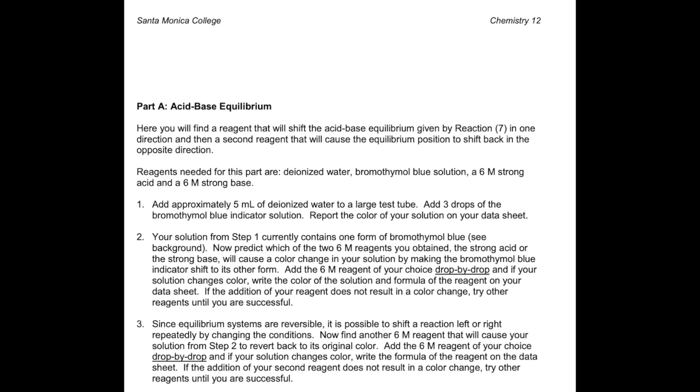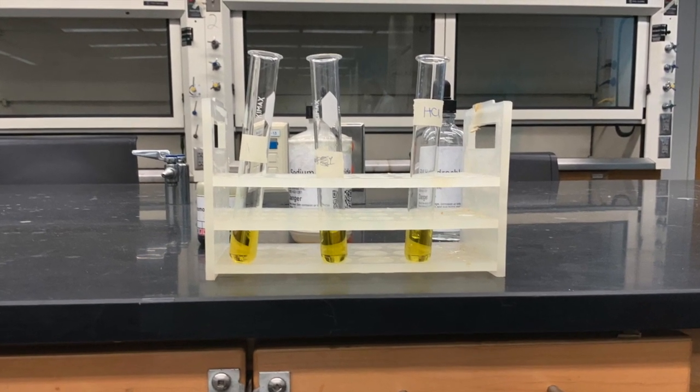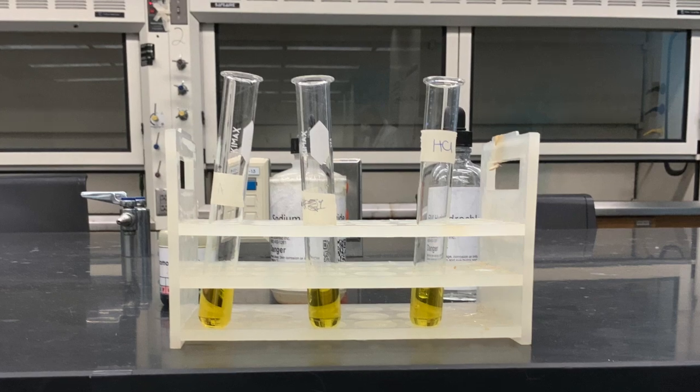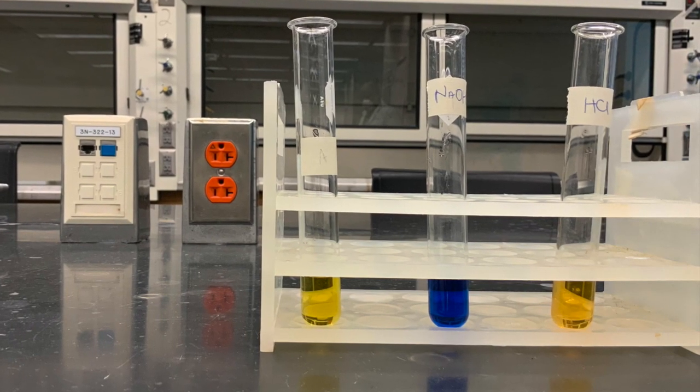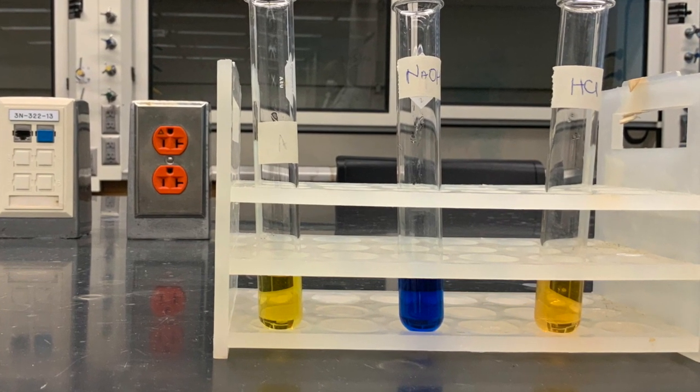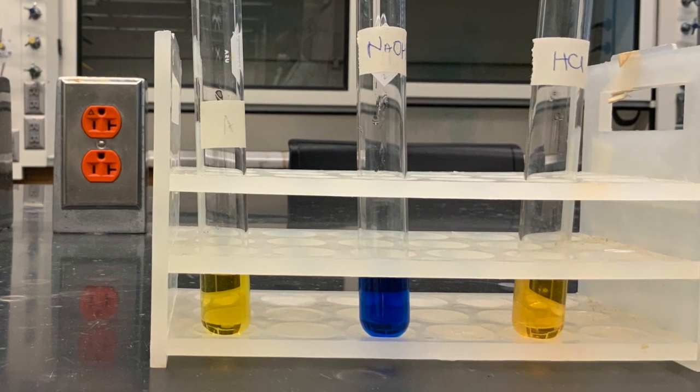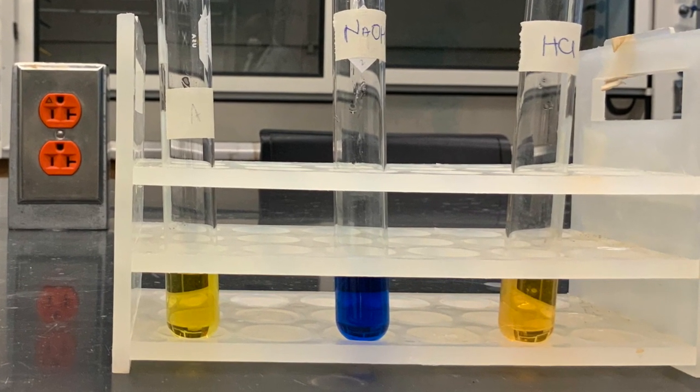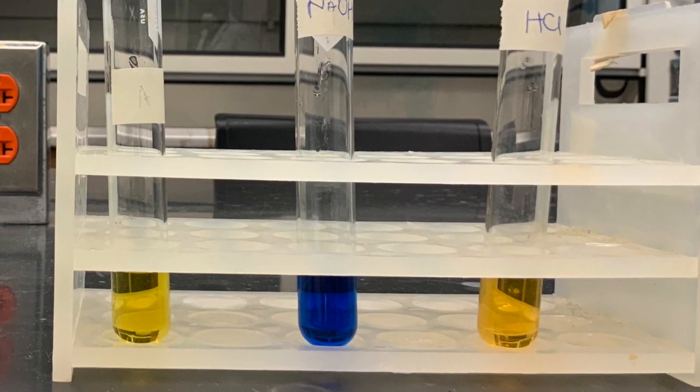We start by adding bromothymol blue, an acid-base indicator, into 3 test tubes at 5 ml each. Record the original color in your lab report. We leave the left-most test tube unchanged. To the middle test tube, we add a few drops of 6-molar NaOH, while to the test tube on the far right, we add a few drops of 6-molar HCl. Use these colors to help you answer the questions in your lab report.